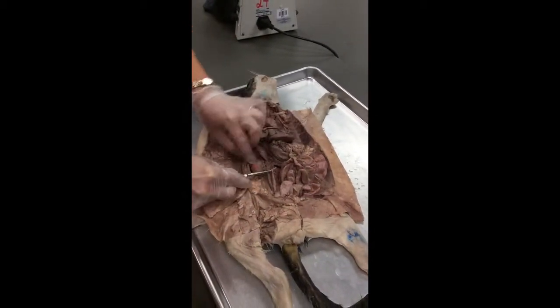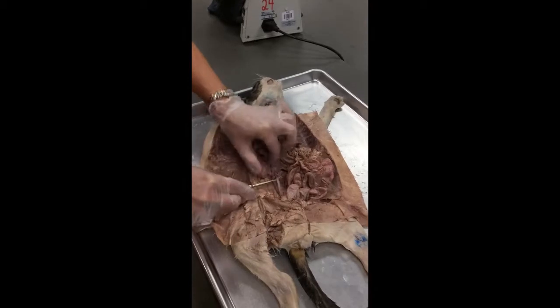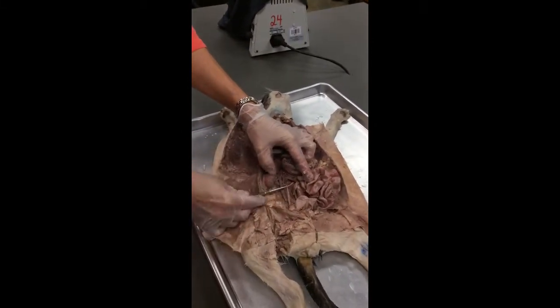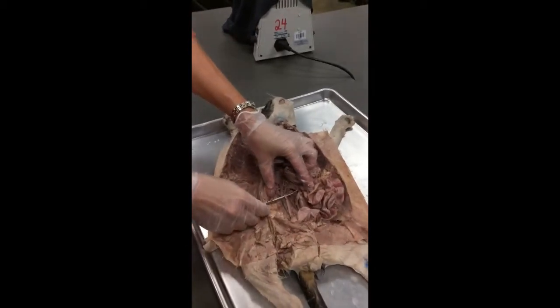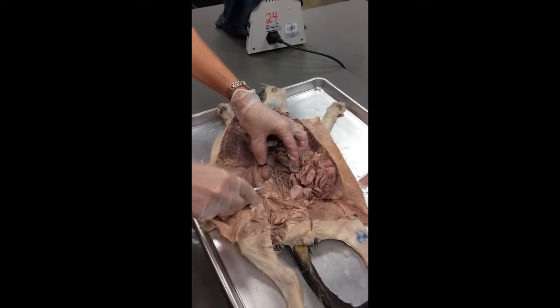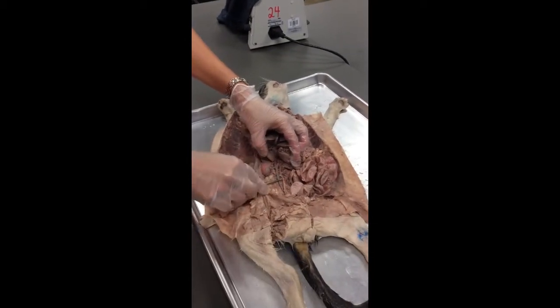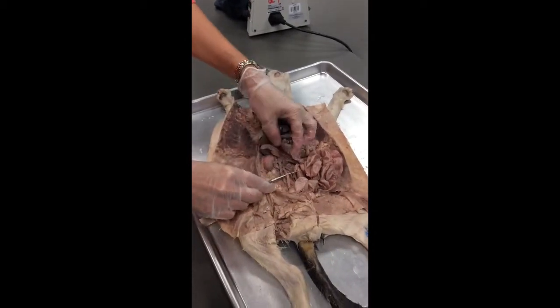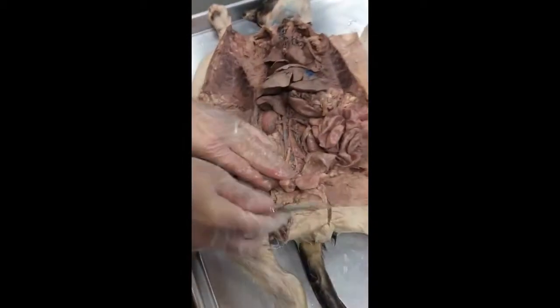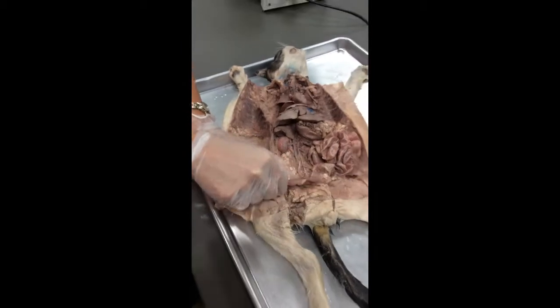Vena cava. Well, actually, this one. Renal? No. Ureter. Yeah, and that's what it is. And I can't really give you half credit. Ureter is distant. So the ureter comes from the kidney, goes down, and this is the bladder. So it's kind of a small bladder, but that's the bladder.